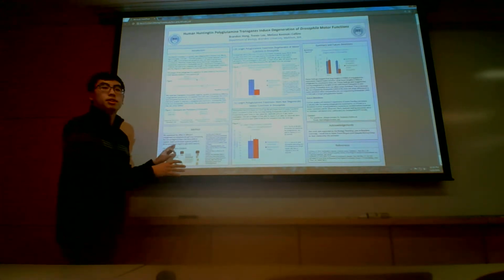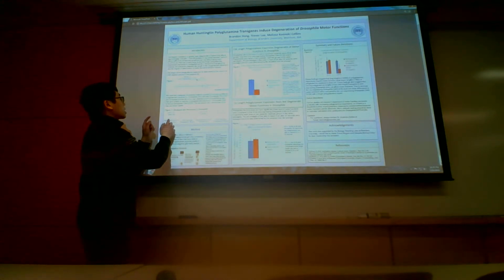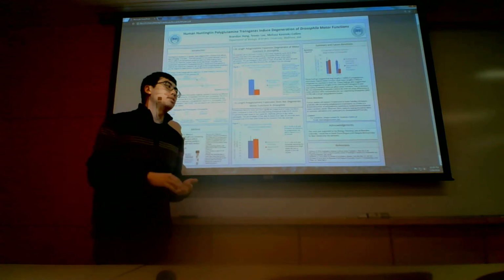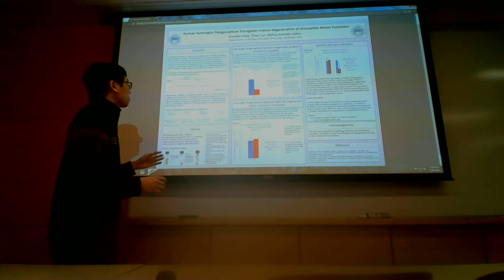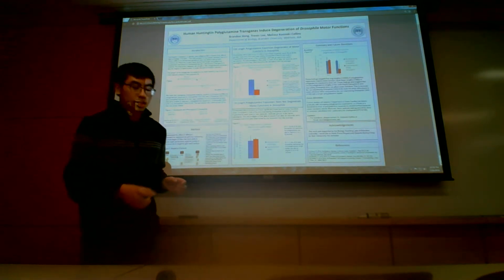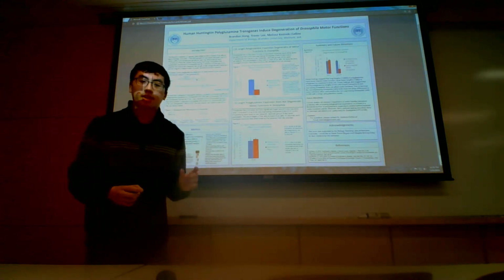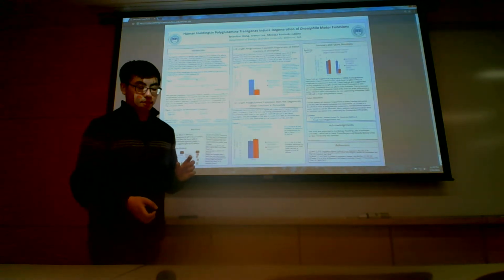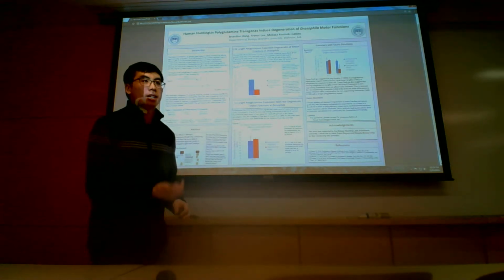We actually did this experiment in duplicate, where there are 2 separate sets of the same genotype. We took the data and averaged them together to form the results here. The method that we used in our experiment is negative geotaxis. We got a vial and we tapped the flies down to the bottom. The flies are now at the bottom, and when we stop tapping, the flies go back up.